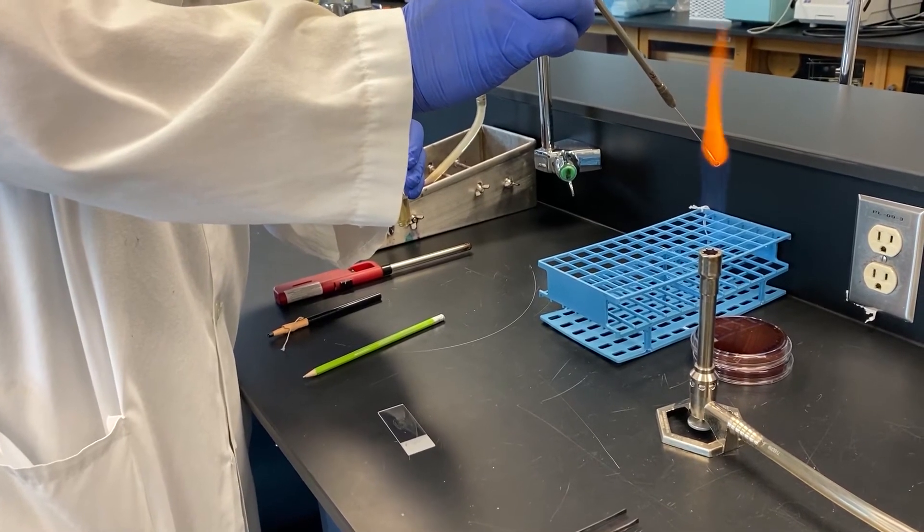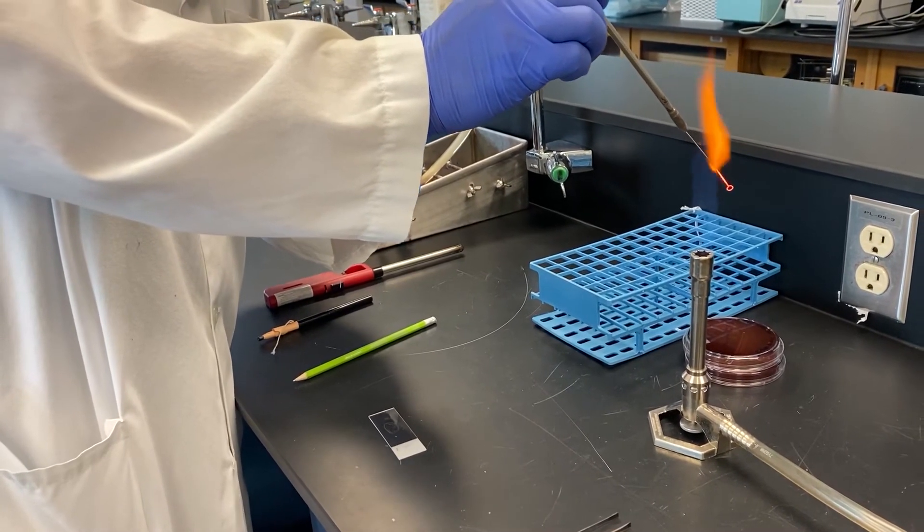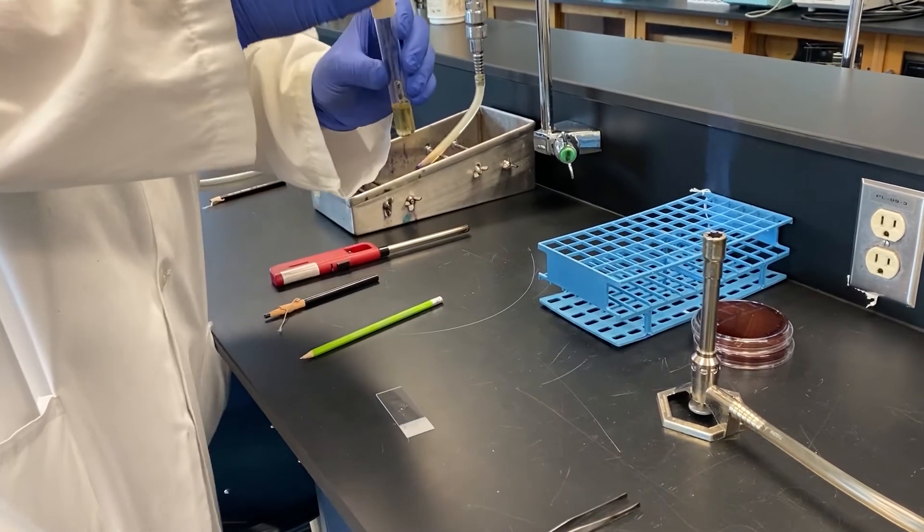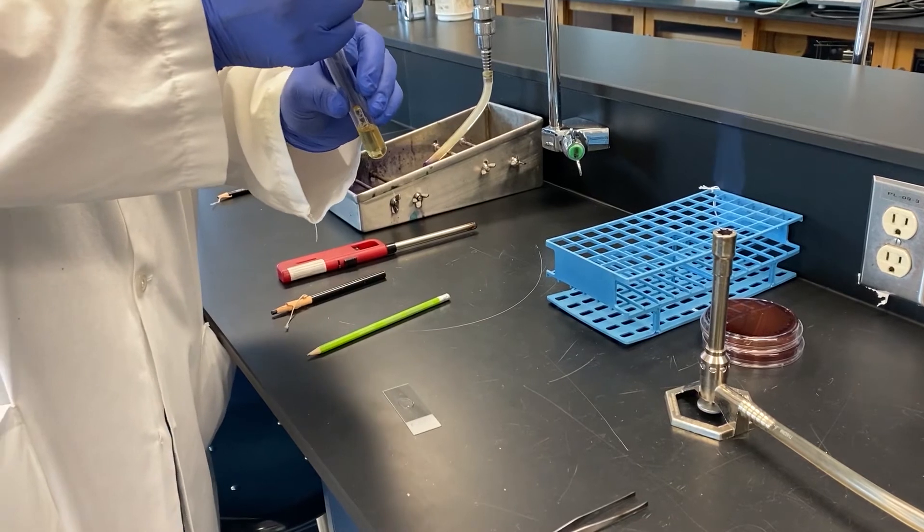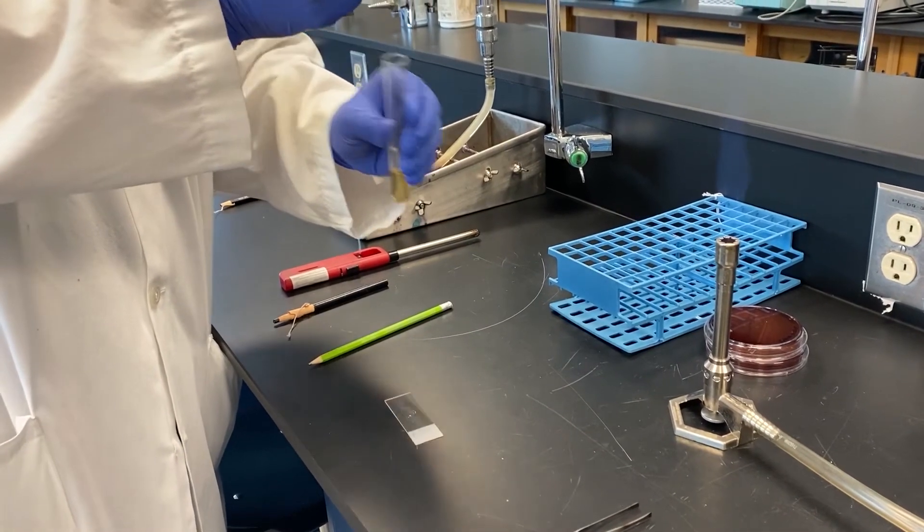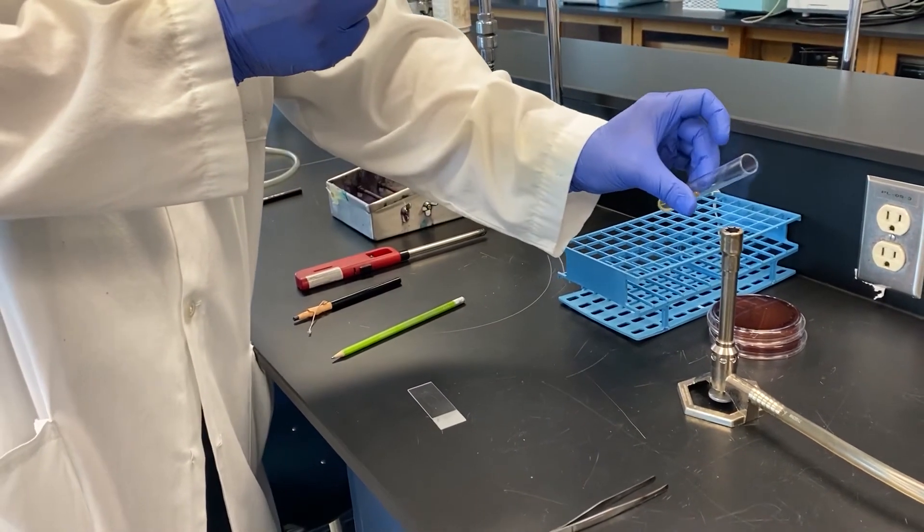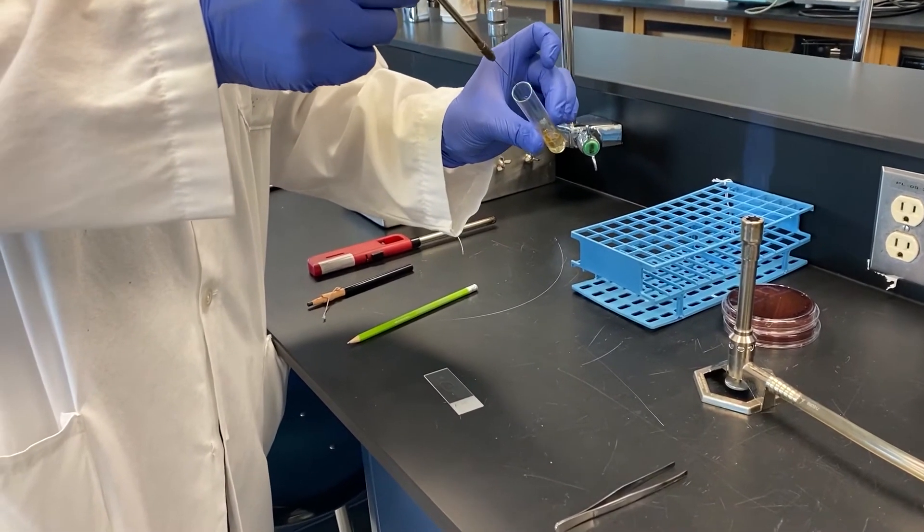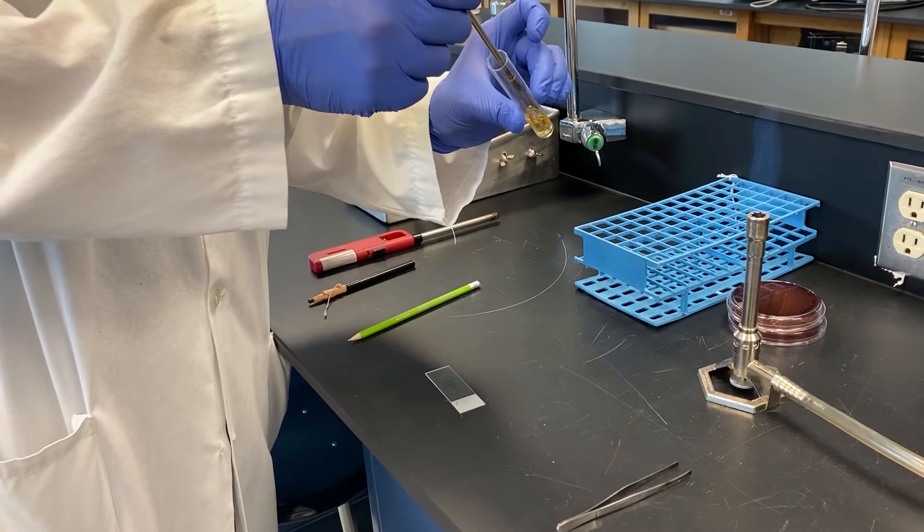Once you have the culture on your loop you can apply it to the circle you drew on your microscope slide. Because bacterial broths tend to be dilute, when preparing a slide from a broth culture usually two, three, or more loopfuls of bacteria are used. Each time using aseptic technique, flaming your loop and the mouth of the tube while collecting the culture.